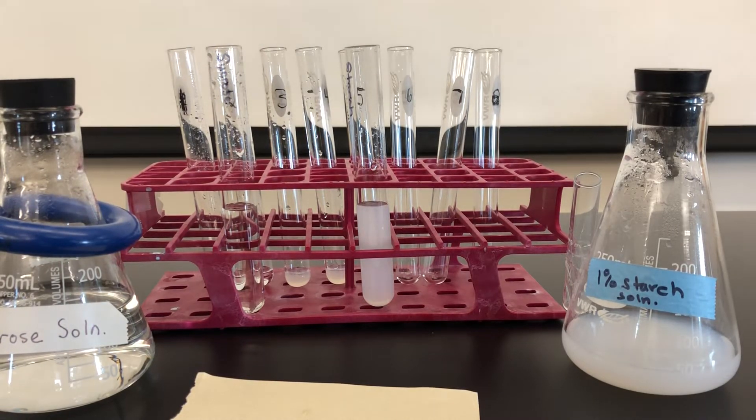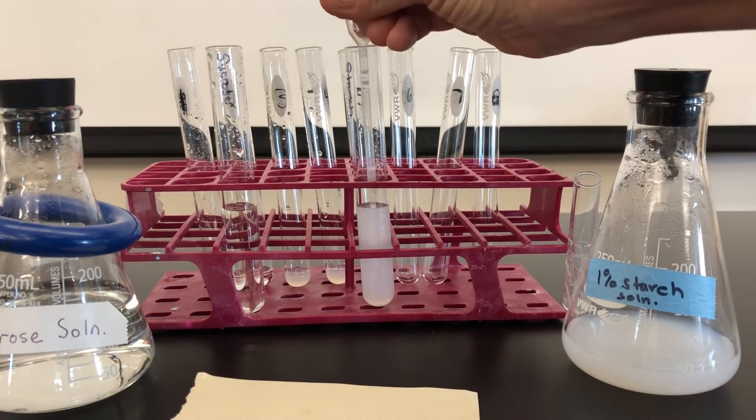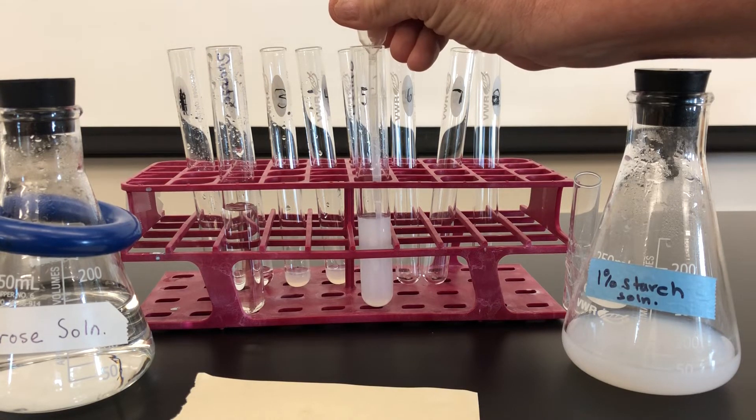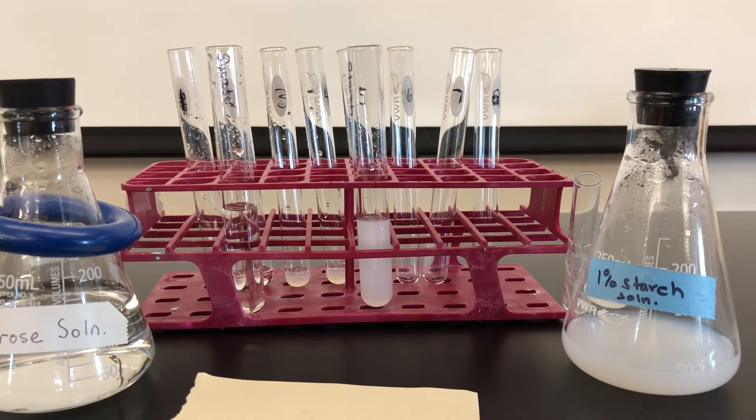It's now been five minutes, and I'm going to draw another one mil out of the starch and put it into test tube five and six.